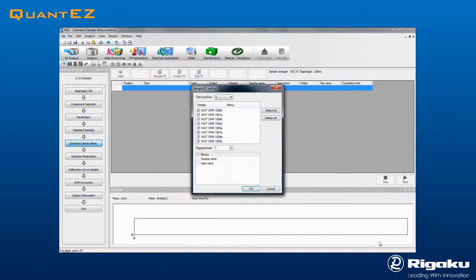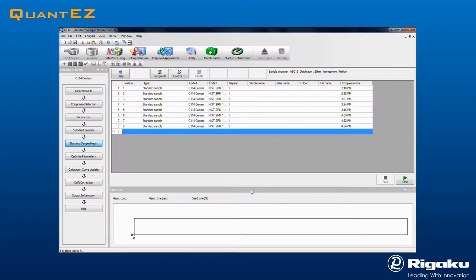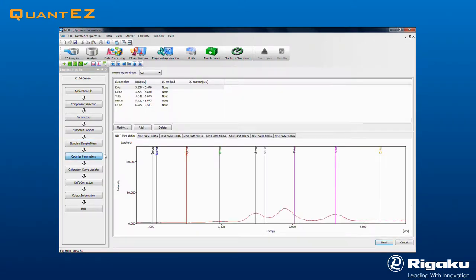Clicking Next brings us to Standard Samples Measurement. Simply load the standards into the instrument in the order shown by the dialog box. A job table is automatically created. Press Start to begin the automatic data acquisition.